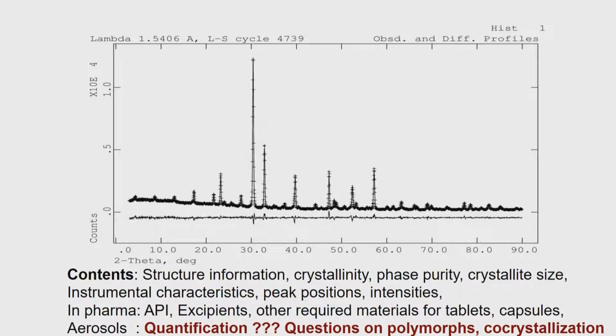Very closely related compounds will resemble each other as far as powder diffraction is concerned. If you have made some changes in the alloying conditions, or in materials, or by substitutions, changing one atom to another, the powder diffraction pattern will not be very different, but it will be different from each other, as I said, because it is the fingerprint of the given material. So, phase purity is one possibility which we can analyze. More than one phase can also be analyzed in a powder diffraction analysis. We will see that as we go later.